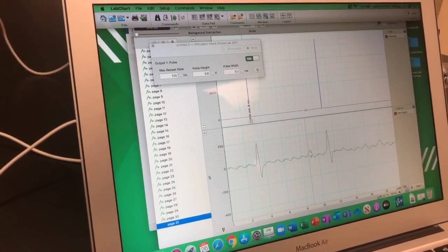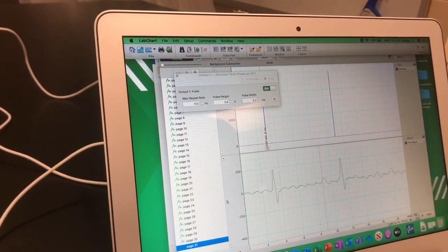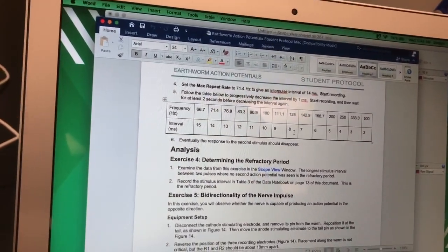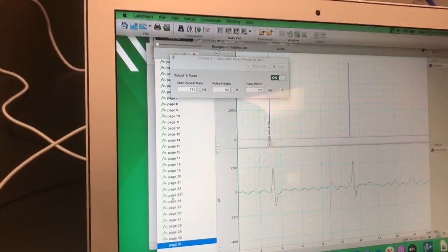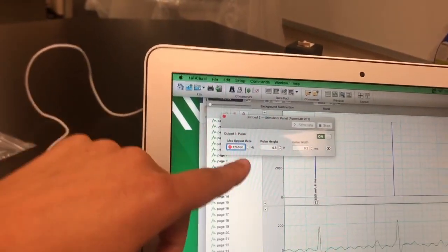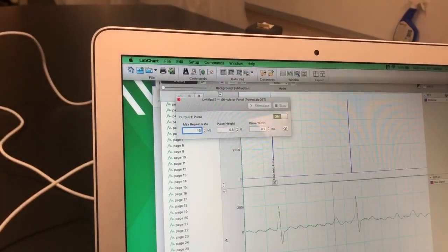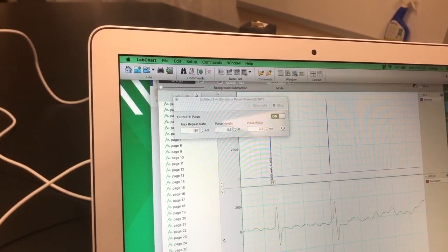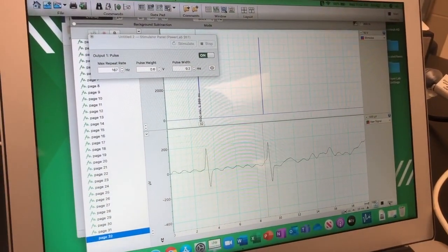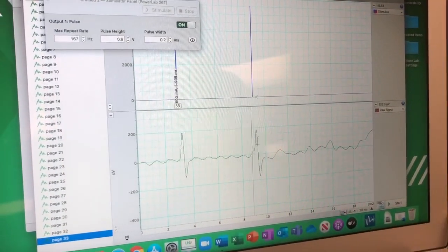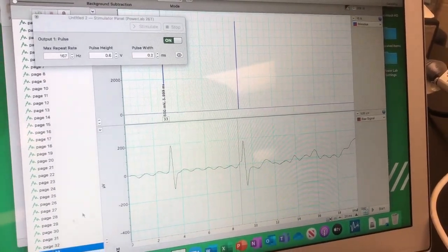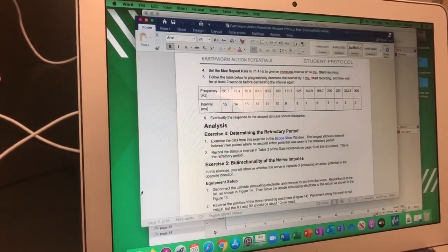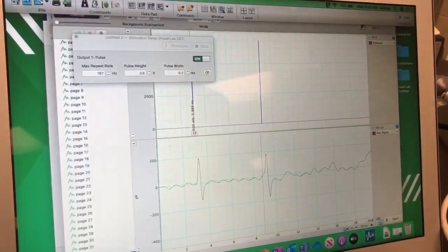We're at 8 milliseconds, so let's go to 6. We change this to 166.7. You can see maybe—let's do it one more time. You see a little hint of that second action potential right there, but it's kind of covered up by the stimulus peak. Here's the other one, the first one. Let's see if that little hump there goes away if we go a bit further, to 5 milliseconds.